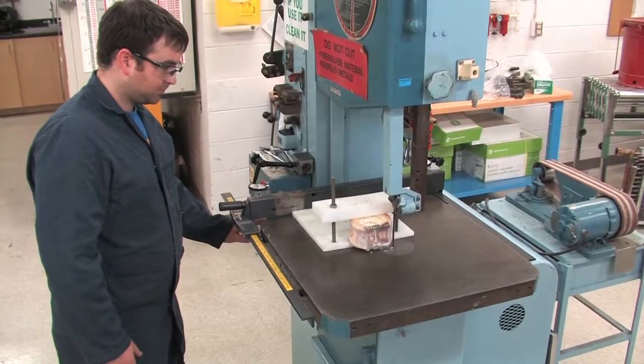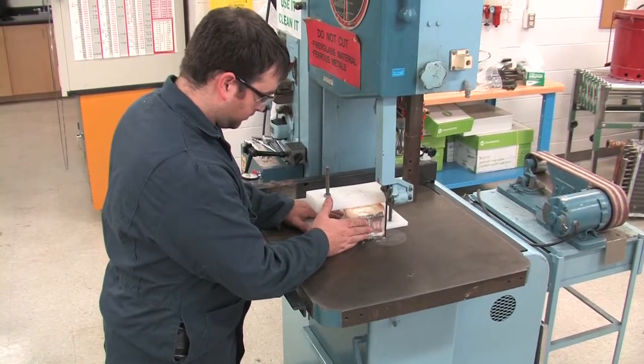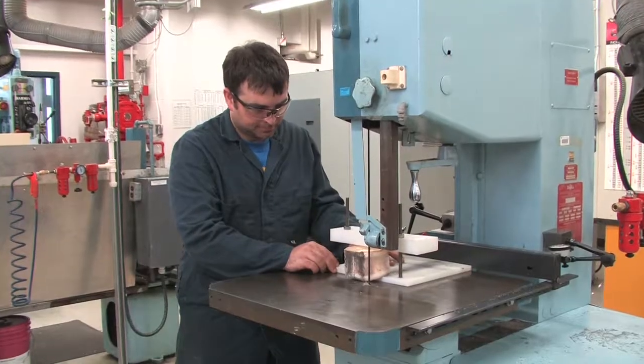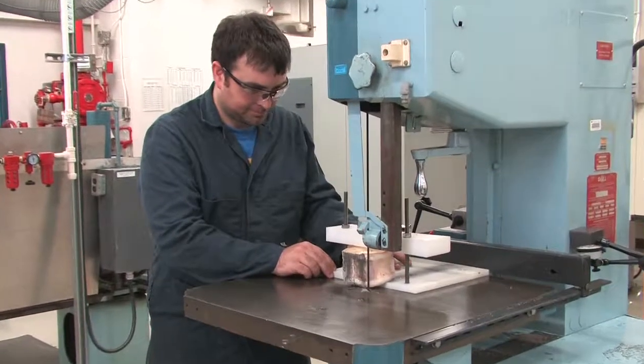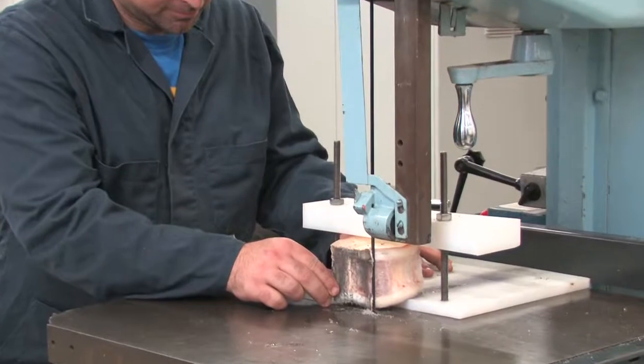If this is your first time trying this procedure, make a test cut away from the core near the edge to test the thickness of your cut. This side of the vertebra won't be used for aging, so you can practice adjusting the guide to get the desired thickness of your sections.